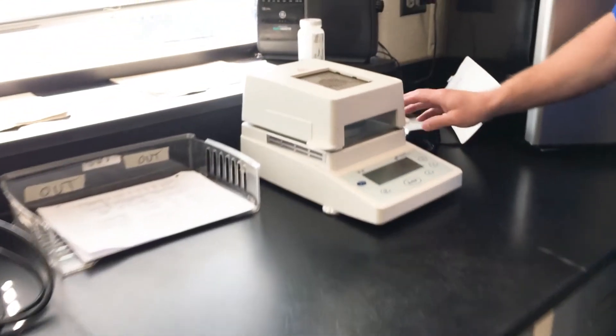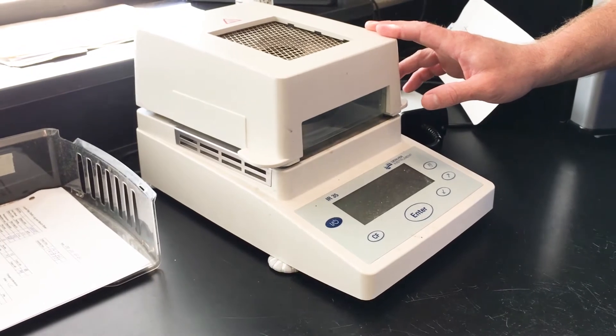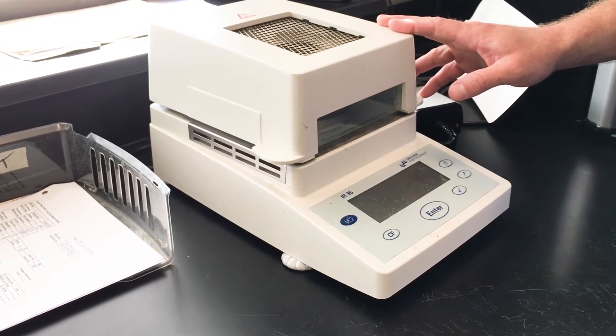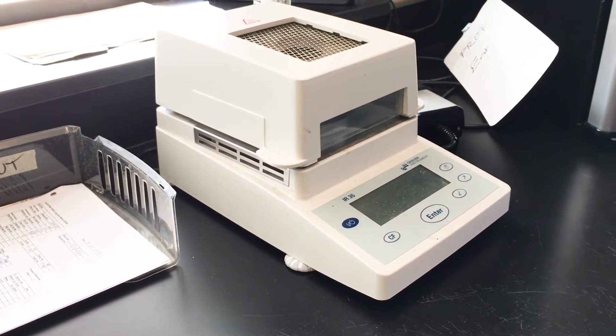This is our suspended solids burner. What we can do is test to see how dry our solids are that we're getting off our belt press, or check our mixed liquor to see how much actual dry solids are in our plant.